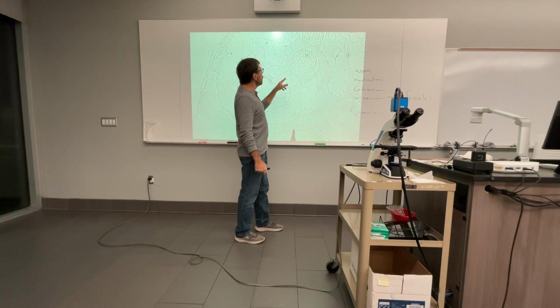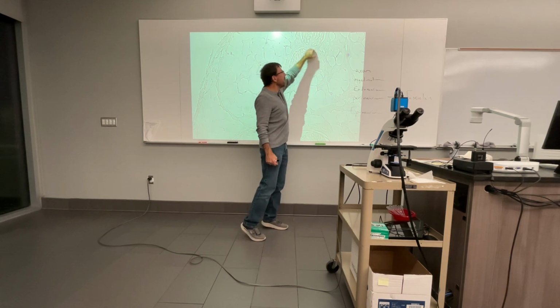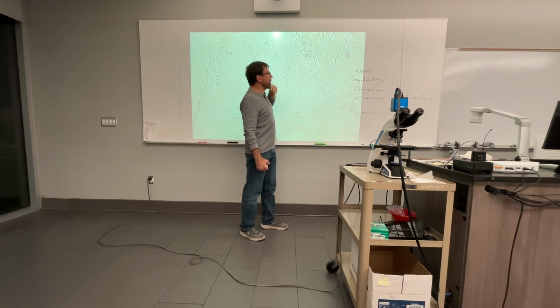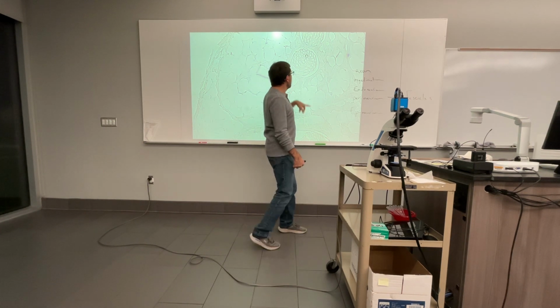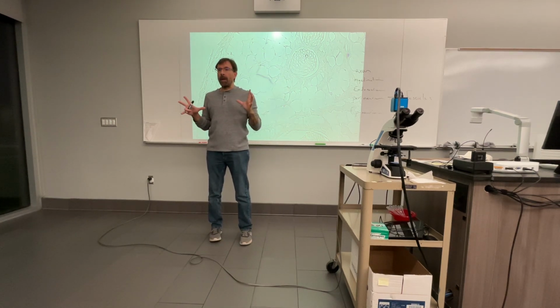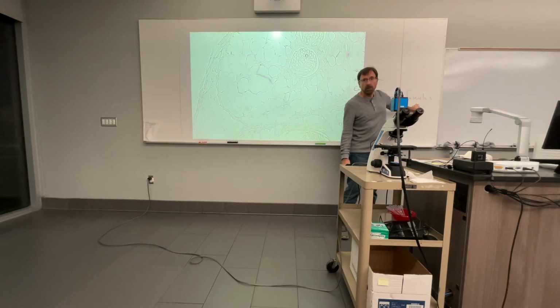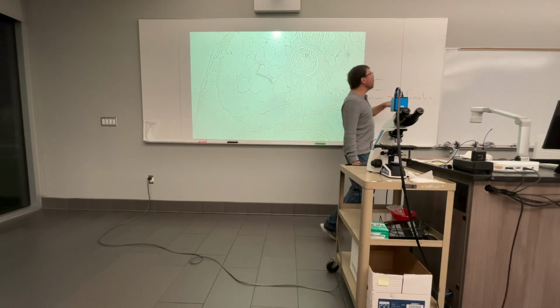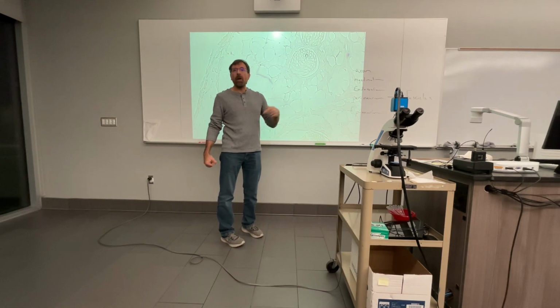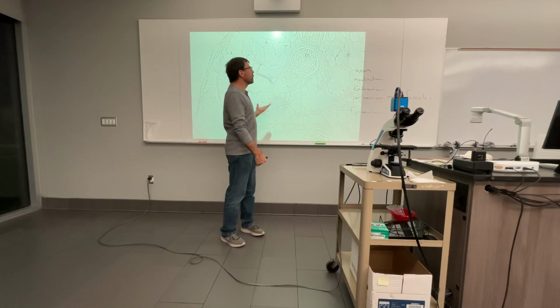Surrounding the endoneurium, or surrounding this grouping, is going to be the next layer, okay? And how do I know that that's the next layer? Because I can see that this is forming a very isolated group, right? And that group that I'm seeing there is what we call a fascicle. So that which is surrounding it is going to be your perineurium. Peri means to go around. And fascicles are circular.